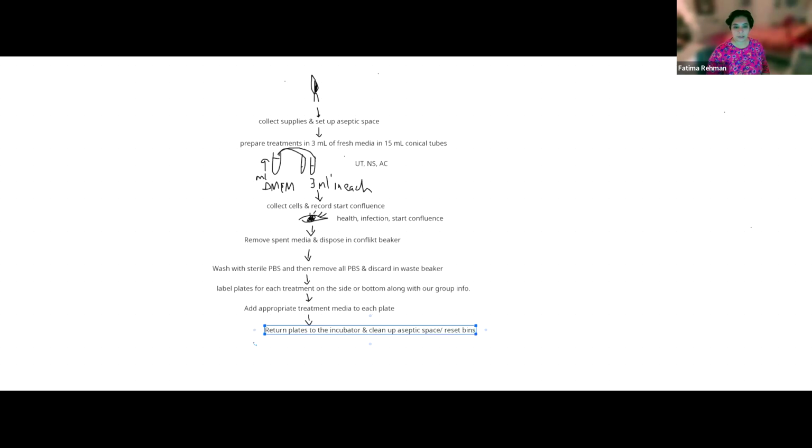One more thing that I did not remind you of. So when we prepare treatments, how do we add the drugs to them? How do we add the drugs to our medias, the treatment tubes? What do we use? Well, you're putting them in the tube, so it doesn't really matter whether you're shooting it directly on or not, but there is something. Which type of pipette?